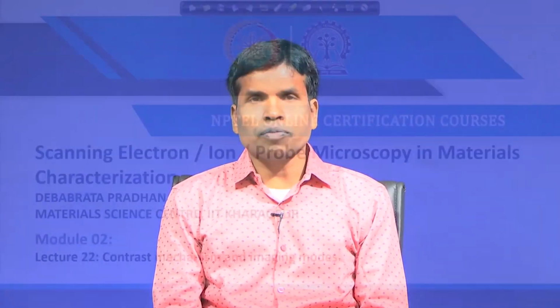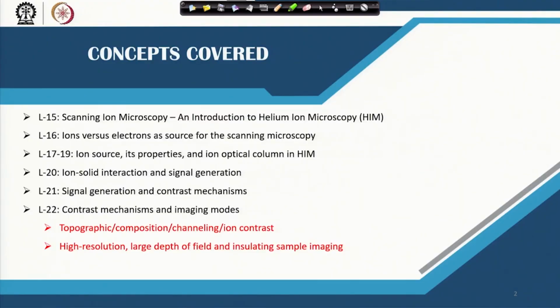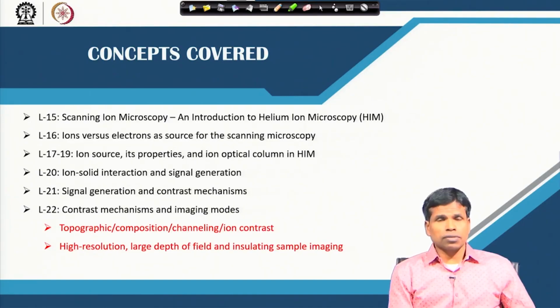Welcome back to our NPTEL course on scanning electron and ion probe microscopy in material characterization. In the last few classes we have been discussing scanning ion microscopy. In that topic we were discussing different contrast mechanisms. Today we will continue with that, and also we will move forward to different imaging modes.